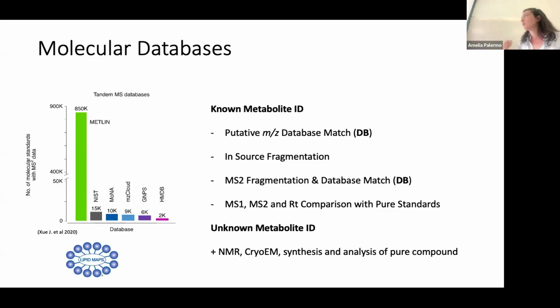For these ones, NMR also provides additional complementary information. Cryo-EM has also been used in a very impressive way to characterize the structure of small molecules as well. So of course, it's a very expensive technique so far, but very, very powerful for looking into this kind of structures. Synthesis and analysis of pure compounds, right?